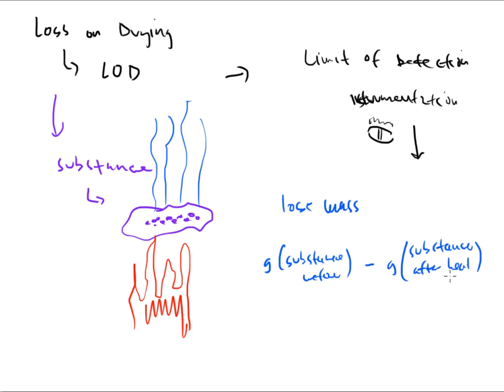It's going to weigh less. I've driven the moisture off. That was mass. That's no longer there, so my weight should go down. If I take these two and subtract them, this will give me an idea of the grams of what we would call moisture.